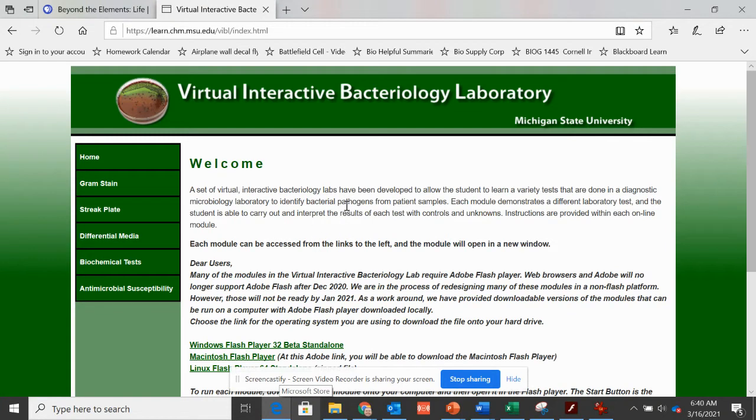All right, so I wanted to make a video for you guys showing you how to open up this virtual lab. Again, these are from Michigan State University. They do an excellent job highlighting a lot of the stuff that we want to learn in this class. To get there, though, it's a little tricky. Depending on whether you have Windows or Macintosh will determine which of these you're going to click. But to open this virtual lab, this is what you need to do.